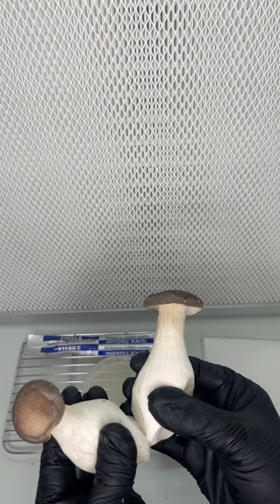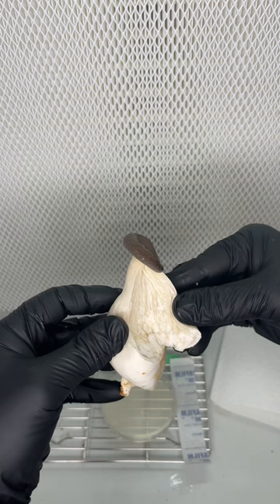In front of a laminar flow hood, I ripped the mushroom open, exposing the sterile tissue on the inside, and I used a sterile scalpel to transfer the tissue to an agar plate.